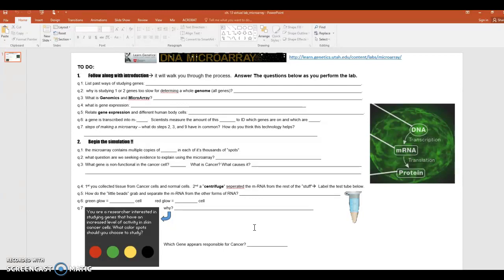So, let's see if we can jump in. I'm going to show you how to use the website, and then I'll let you free to proceed, all right? So use the video as needed when you get confused. And if you don't get confused, great, just follow along the worksheet. But if you do hit some bumps in the road, of course, just stop the work on the worksheet and then watch the video for the section we're on, all right?